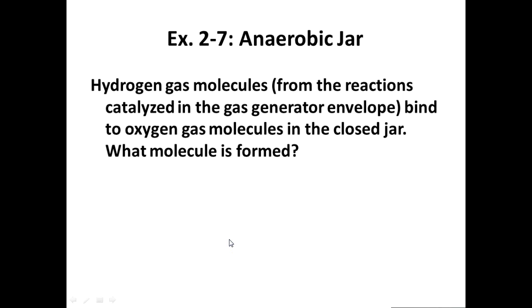So what that packet is, that packet that we're looking at, is a gas pack generator. And it comes sealed, right? And we open it up and then we put it into the jar and seal up the jar. What happens is hydrogen gas and carbon dioxide gas form. But the hydrogen gas is what binds to the oxygen, and what molecule does it form? What do you get when you get hydrogen and oxygen? Water, right? You get water.